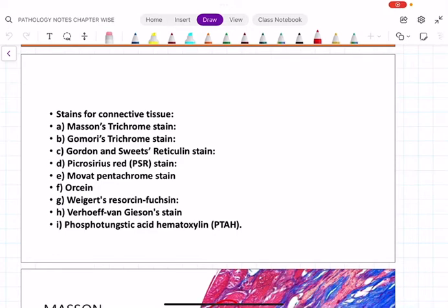In hemochromatosis, what will be the histopathology? We will use Perls' Prussian blue. The iron will be blue in color. That is ferric ferrocyanide, the compound which gives that Prussian blue color. So you already know the concept, and there is no need to mug up. If you don't have time during your exam to go through the histopathological features of Wilson's disease or hemochromatosis, you can say this is the stain we are using. If you write that, that itself will fetch you good scores.